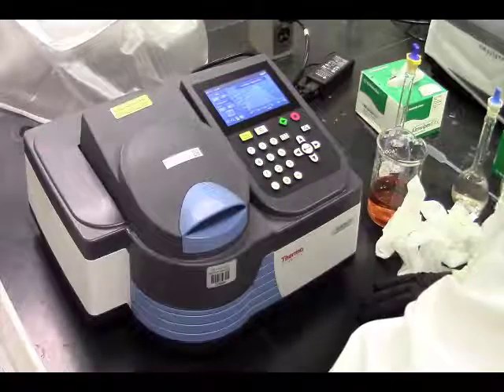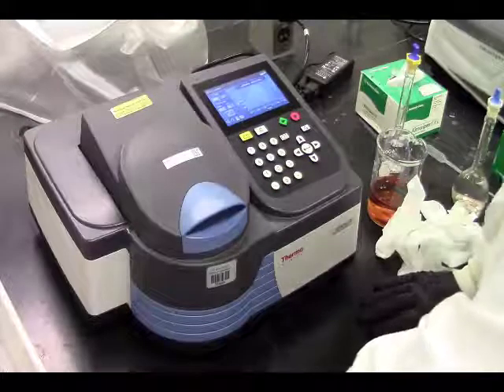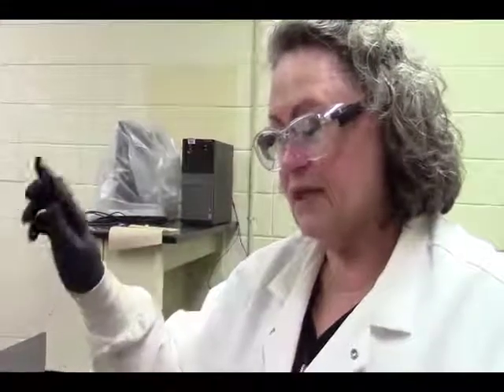So you will need to take those values. I will put these on Canvas for this lab. You'll need to take these values and you will need to make your standard curve. You'll need to talk about why you had to make a standard curve. And then what you're going to do is you're going to find the concentration of iron in your unknown using that standard curve. Then you're going to do your statistical analyses on that, so you'll be able to do an average, standard deviation, and percent RSD. All right.